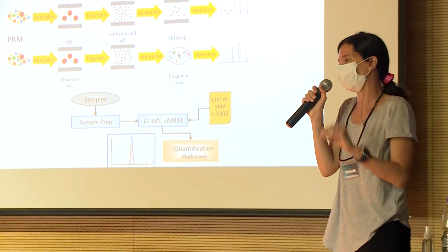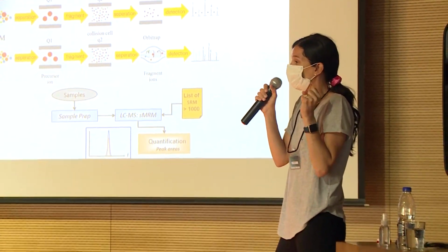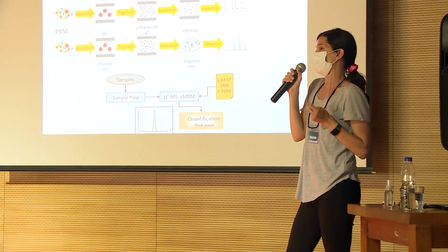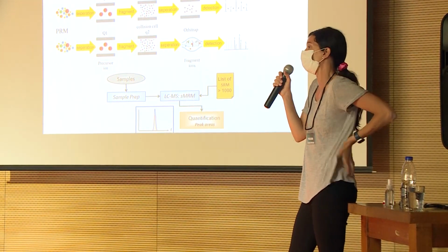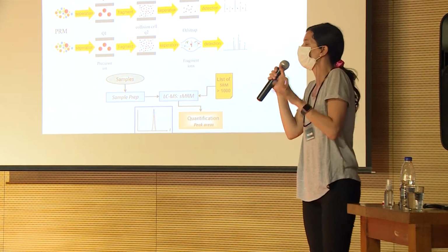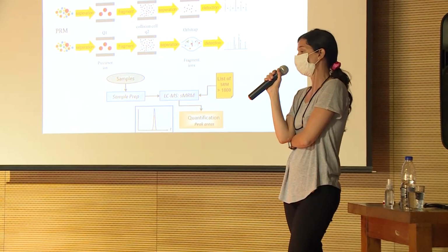You need to get an optimal protein extraction, and then take care of what Germán was asking in the other talk about how you digest it. But once you've done that and you have the peptides, I don't know if anybody else among the speakers has any specific recommendation regarding the mass spectrometry part of membrane proteins. I don't have that much experience, so I have nothing interesting to say about that.